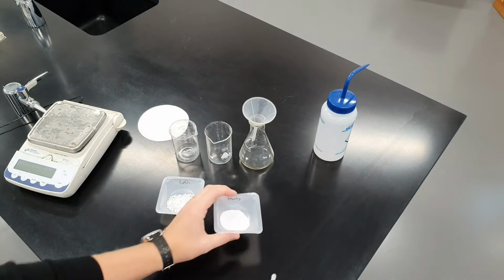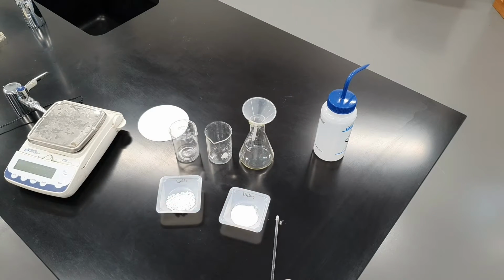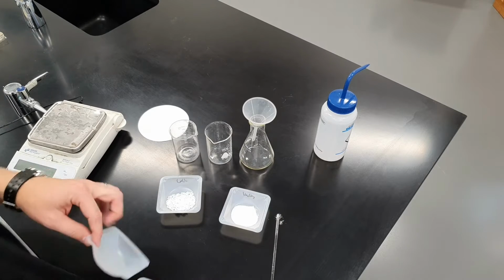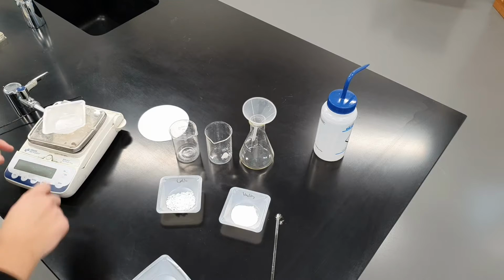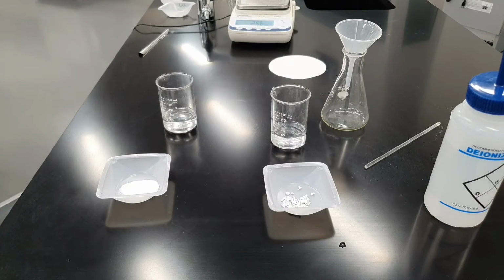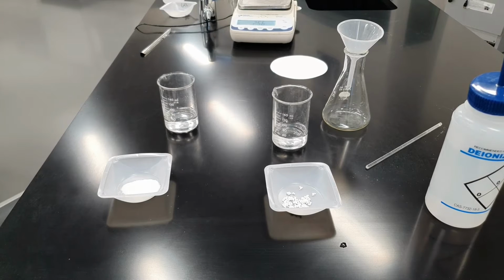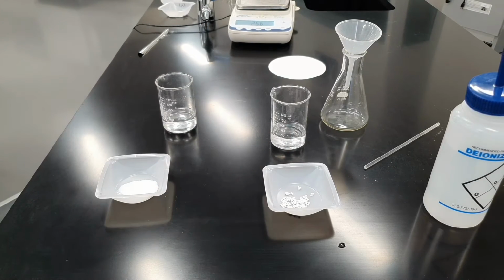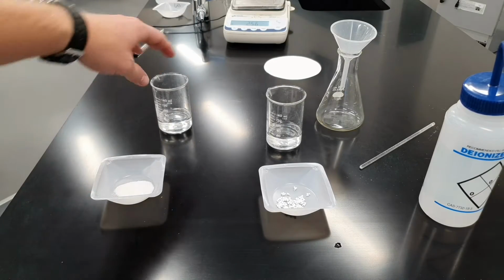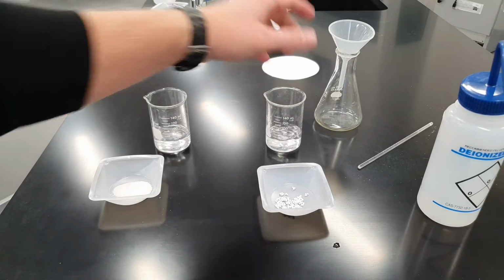If you're following along with the lab, it says that we want to measure out 2 grams of each and dissolve both in 50 milliliters of water. So let's go ahead and do that real quick. I'm going to turn on the power to the scales. Okay, with a little help from the power of YouTube and the edit, we've got 2 grams of both calcium chloride and sodium carbonate already measured out, and we've got our 50 milliliters of water for both.